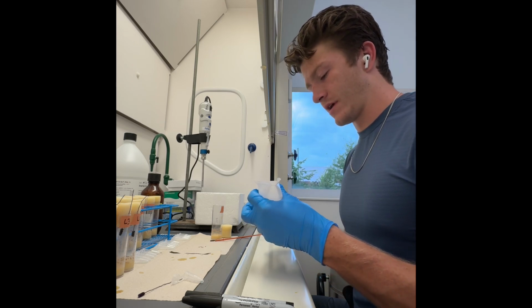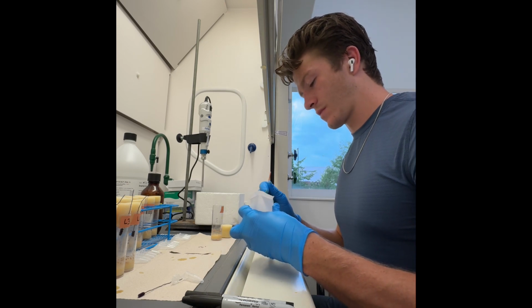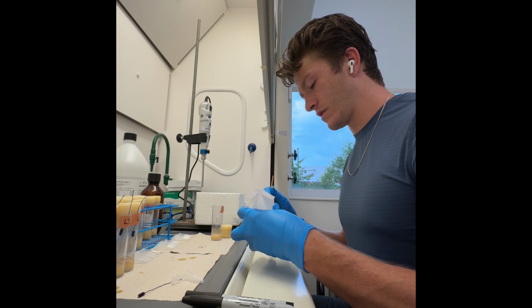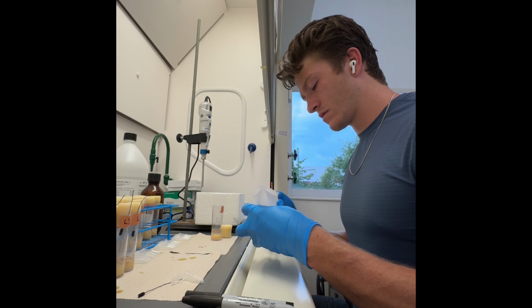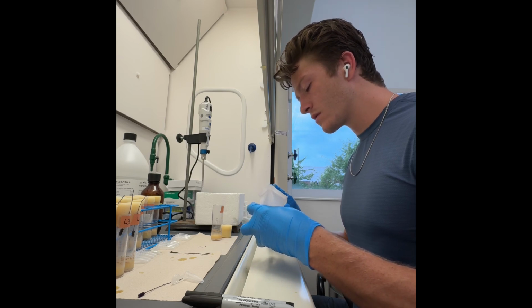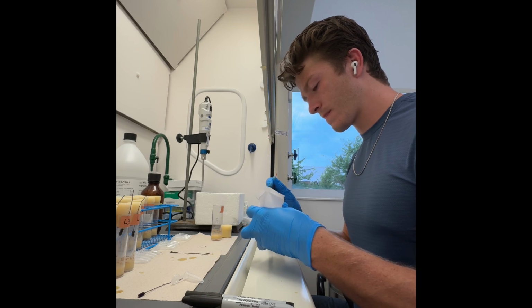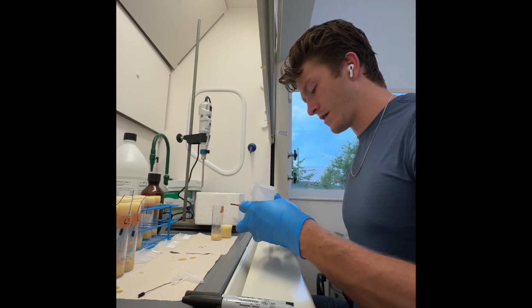And I fold that, put that on top of there, like such, and then move them, plate them into the vial. 1, 2, 3, 4, 5.